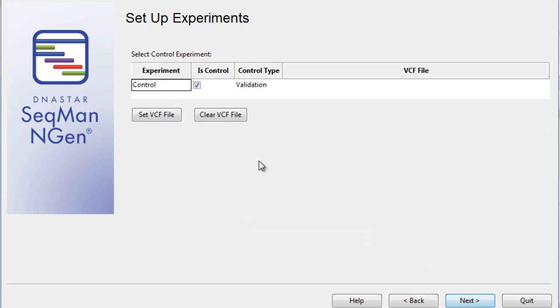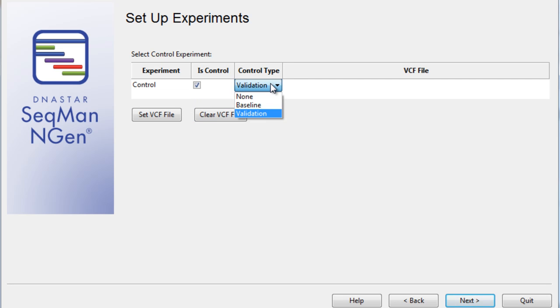In the next screen, I'll choose to set up my experiments as a control. Now, we'll check the box next to our control experiment and double-click to open up the drop-down menu and select Validation as the type of control.